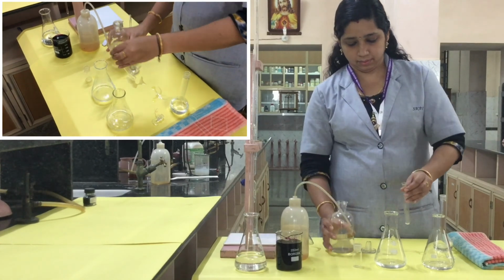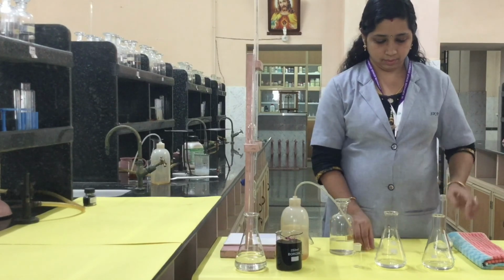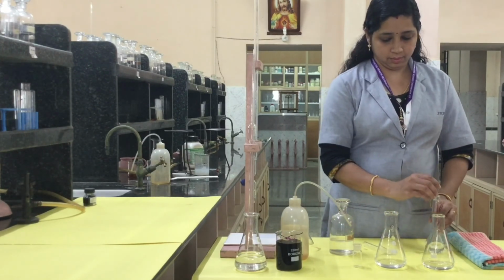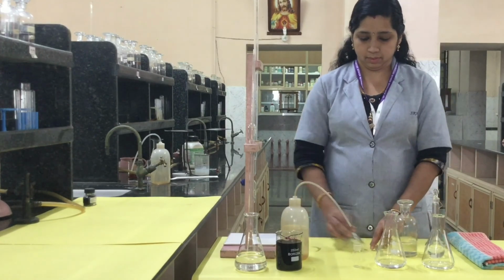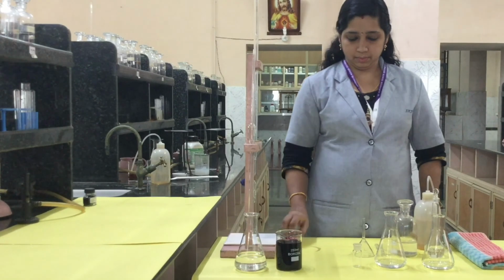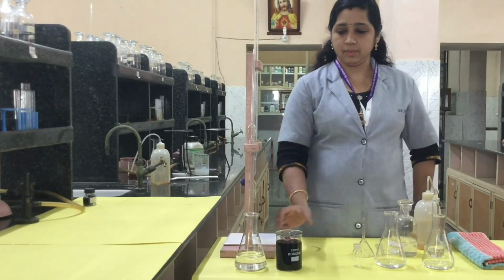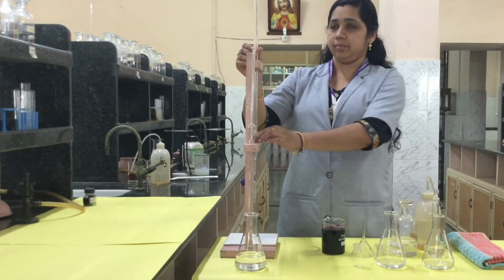Okay, so 2 conical flasks, each containing 20 ml Mohr salt and 1 test tube full of sulfuric acid. No need of indicator here, because we are titrating this with KMnO4. We are filling the burette with KMnO4. So KMnO4 acts as a self indicator. So no need of indicator. A special indicator is not required.